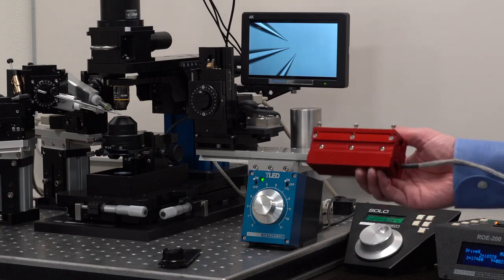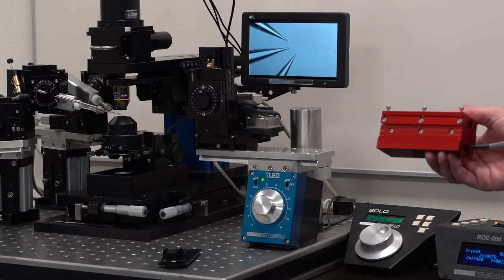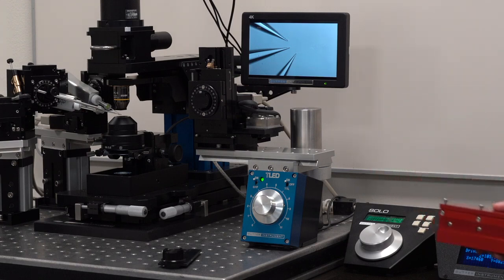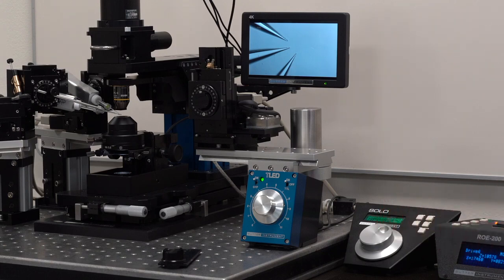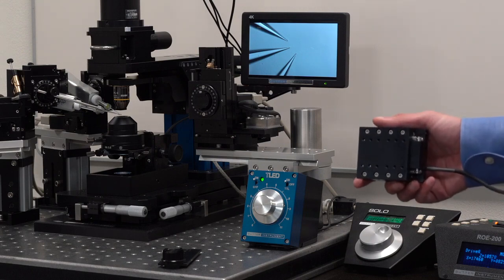My solo can be used to control single axes and that's mostly the way we sell them. In this case, a 50 millimeter moving axis, usually used in in vivo setups with cops and stolting stands. And I do have a 25 millimeter moving axis as well.